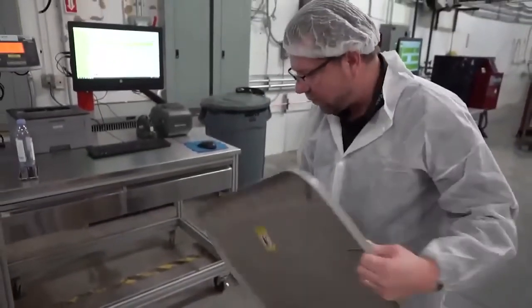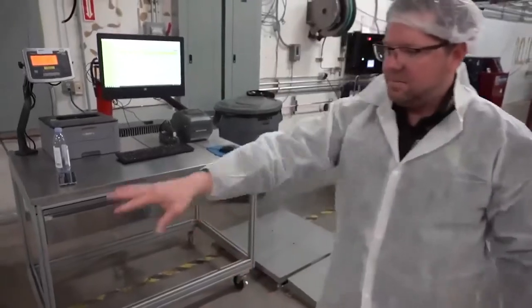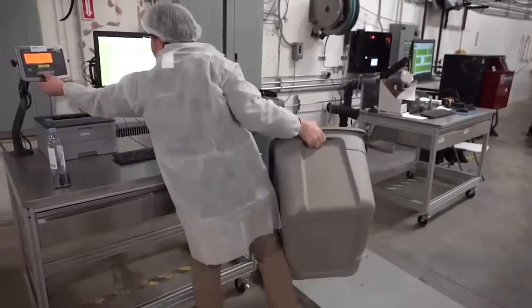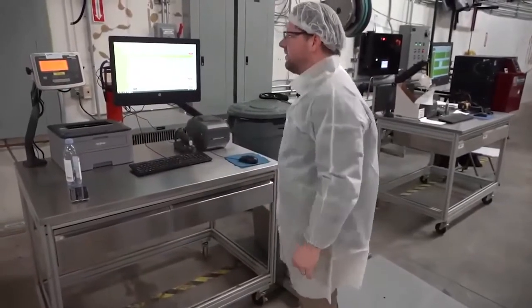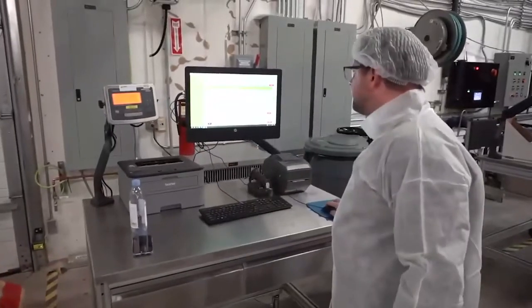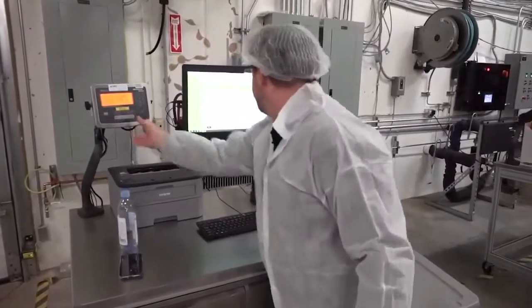So what we would do is we would basically take this and put it on the scale. In this case, I'm going to tare it like this, put it on here. So it's 17 pounds approximately. I'm going to print that off, and the tare weight here.